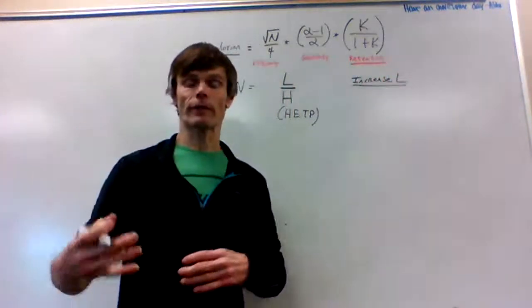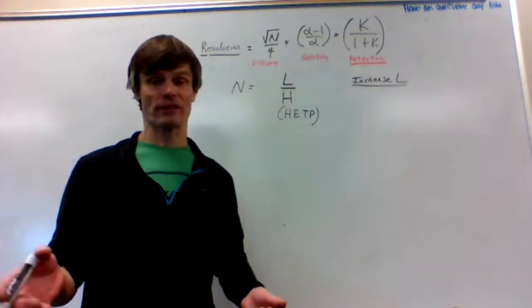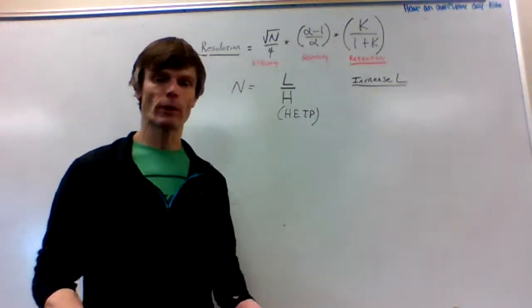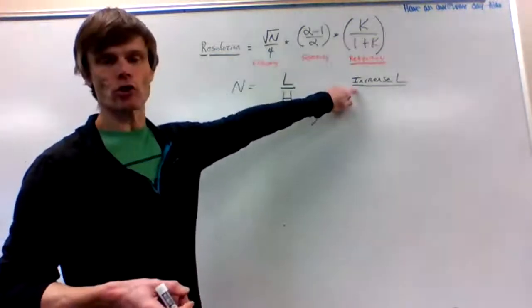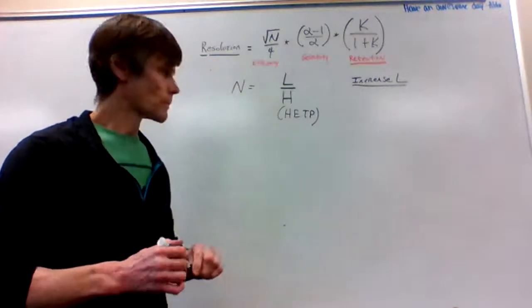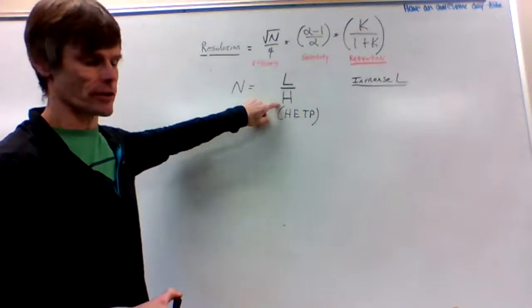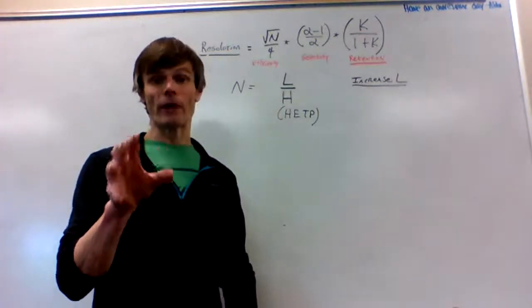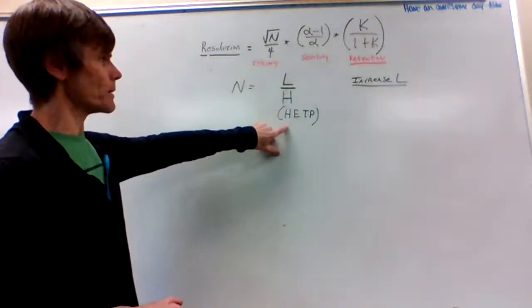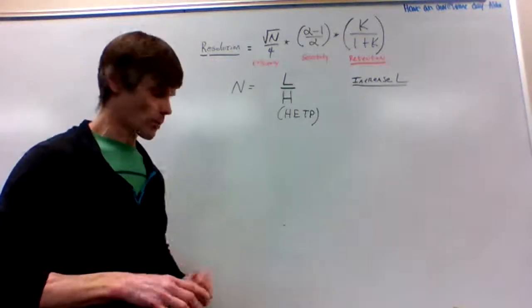Okay, if we increase the length of our column, we're going to increase the number of theoretical plates, but what else? We also increase our analysis time. Maybe not the best thing. Again, you can do that if time's not a big factor for you, but if time's money, that might not be a good choice just to simply increase your column length to get better efficiency and a better resolution. So what's your second choice? Well, we can decrease our height equivalence of our theoretical plate. And normally, that's a better choice to make in terms of improving your resolution. Decreasing HETP would increase the number of theoretical plates, which would increase the resolution for the separation process.